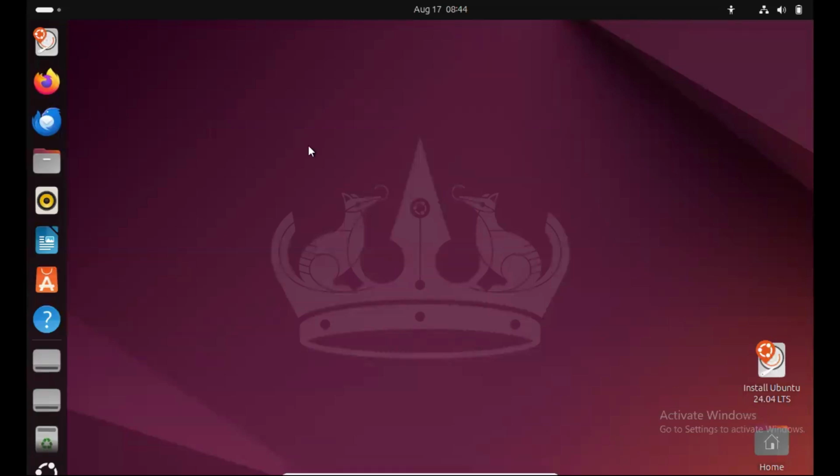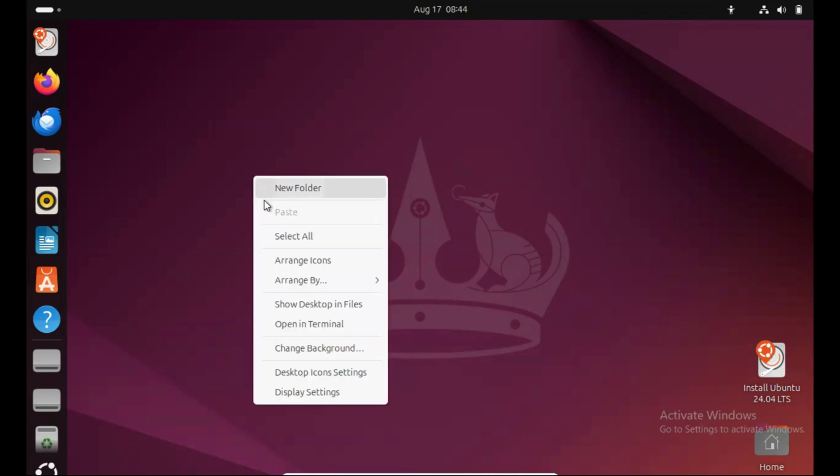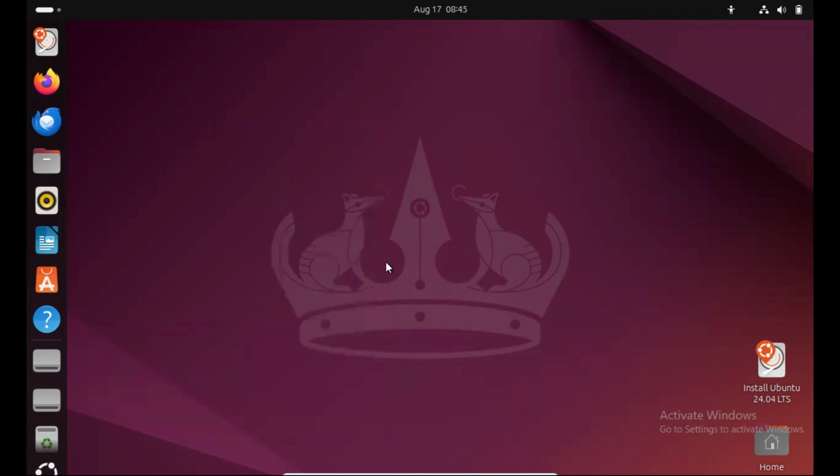Here it just looks like your Windows operating system, but we are interested in the command line, because we will be dealing with sequencing data using the command line. So here you can just open the terminal. Now this is the terminal.